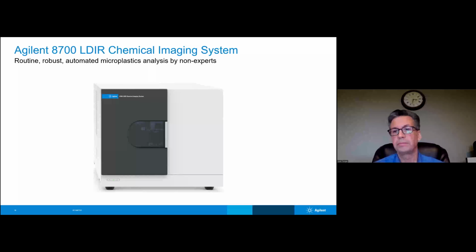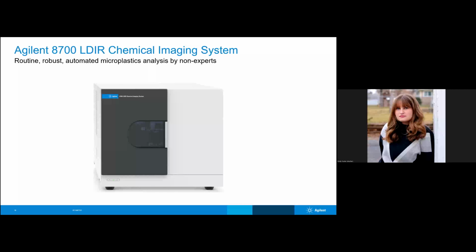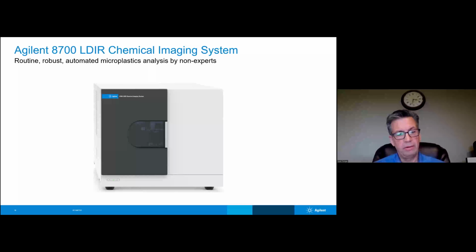Okay, great. And the next one is, what is the lowest size particle that can be accurately detected? Right. These are infrared wavelengths. Our longest wavelength is 10 microns, and so that would be the lower limit. It would be 10 microns. The sweet spot for the system is between 20 and 500 microns, but we can definitely generate data, that is, collect data, from 10 micron size particles.